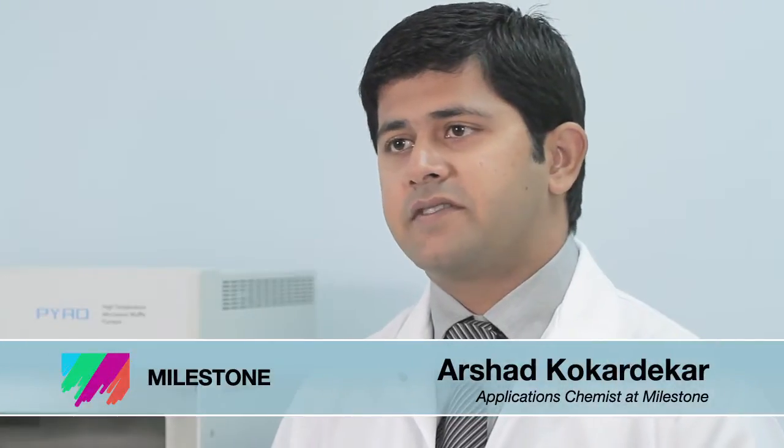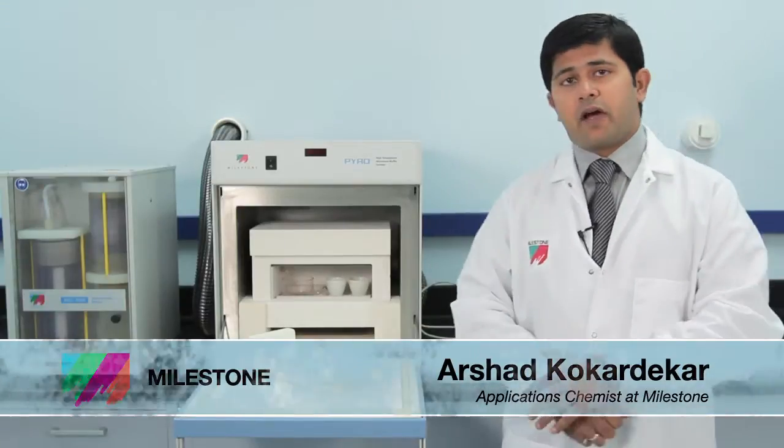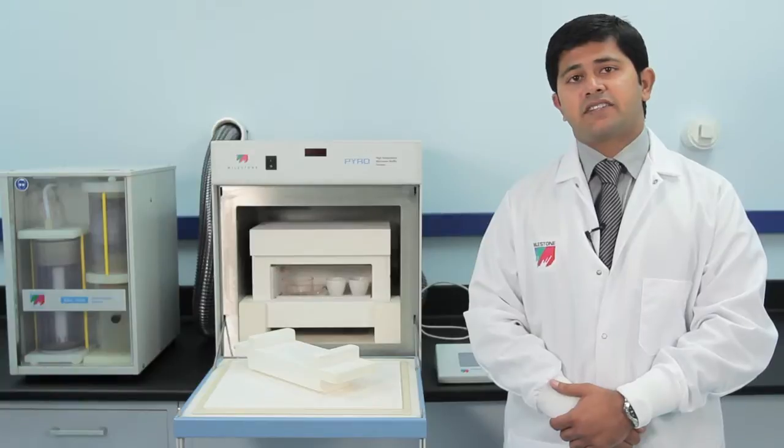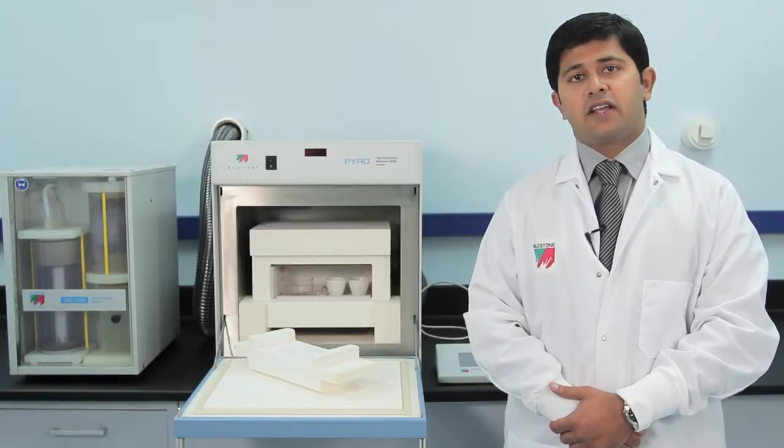Hi, I'm Arshad Kukardeker with Milestone and welcome to our applications lab. This is Milestone Pyro, a microwave ashing system which is faster, cleaner and safer alternative to traditional electric muffle furnace.